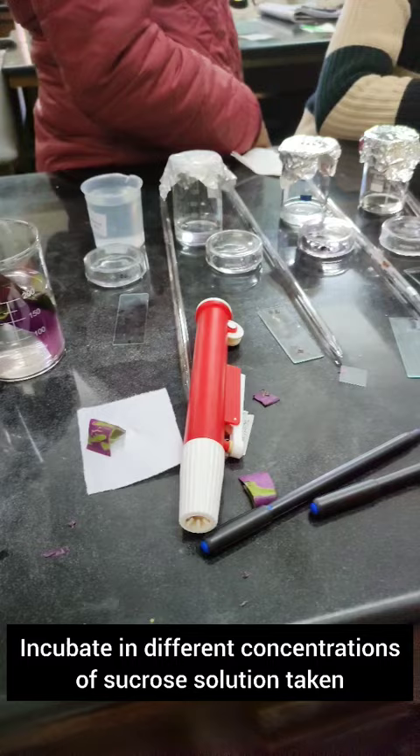After that we incubate the peel in different concentrations of sucrose solution for 1 hour. After 1 hour you can see the plasmolysis with sunken protoplasm.